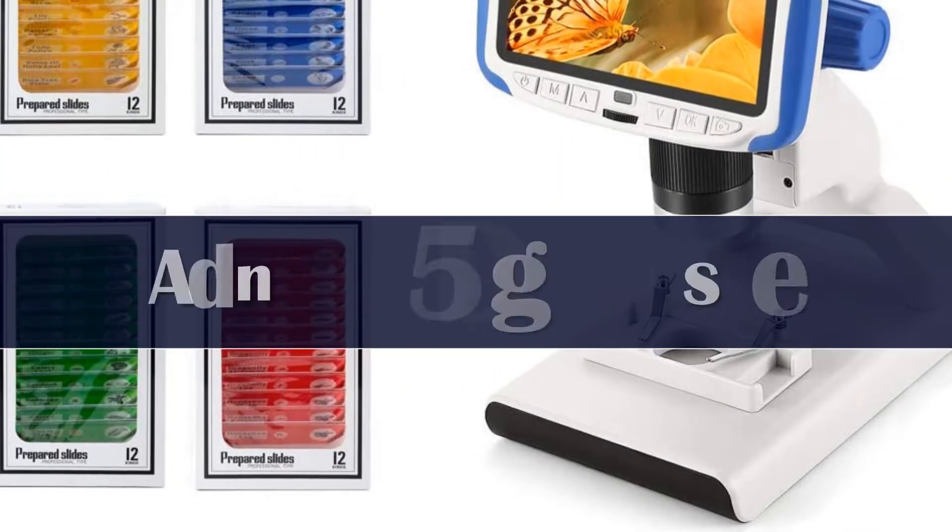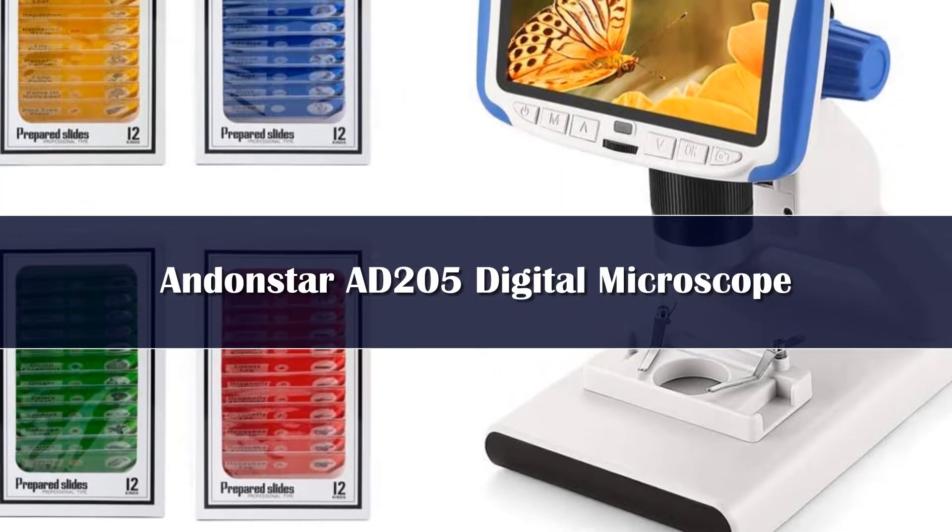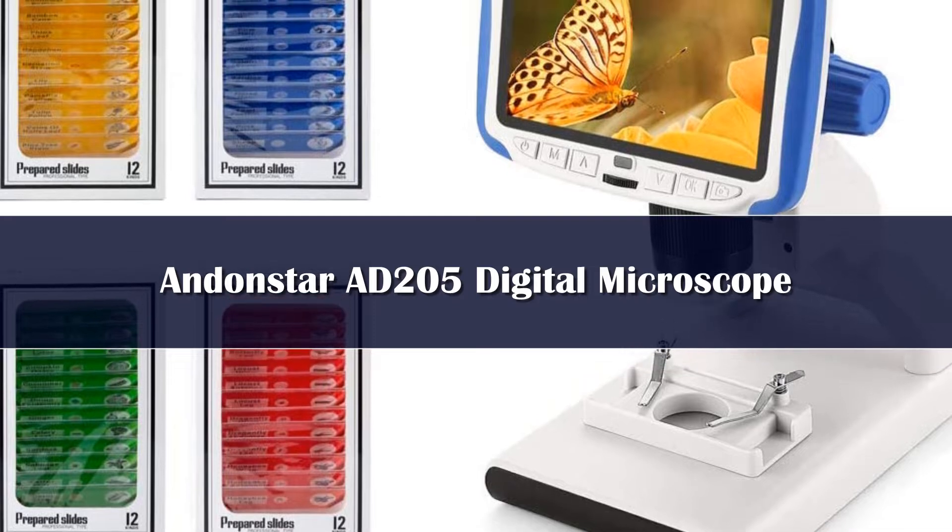Number 4. The AD205 digital microscope features a built-in battery, making it very convenient for kids.